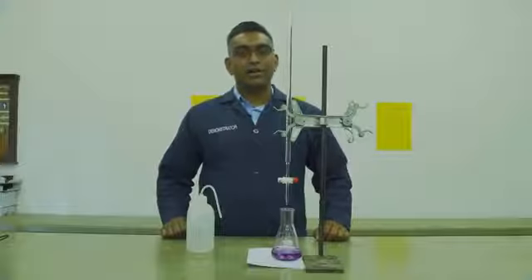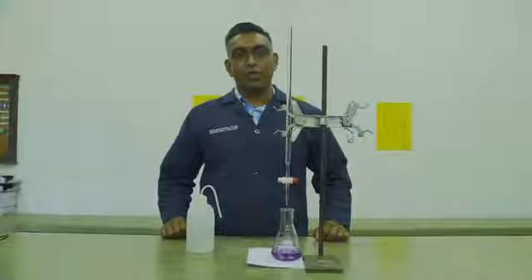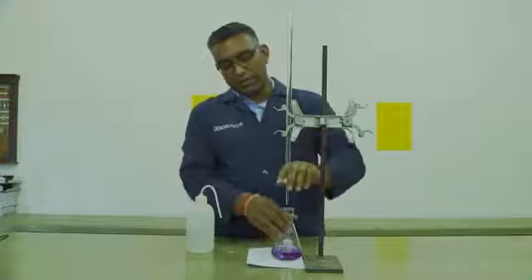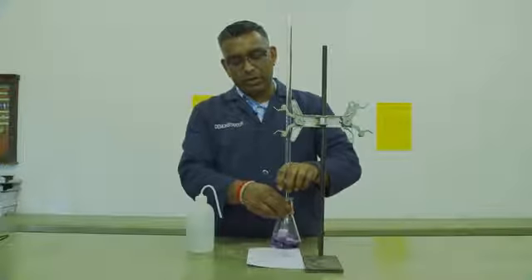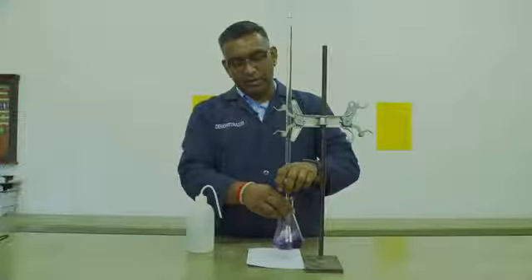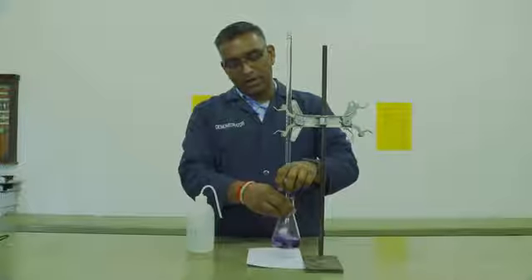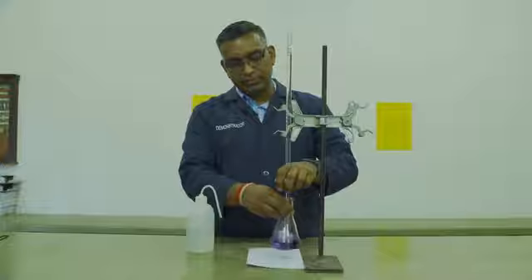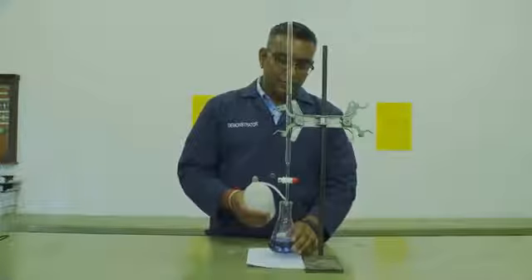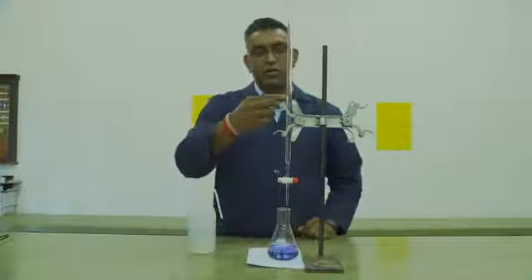You will perform a rough titration and three other titrations as demonstrated in A1. You will record your initial volume, then open the tap and swirl the conical flask while keeping an eye on the color. The color will change from a wine color to a pure blue color. You will then wash off the jet with some deionized water and record your final volume.